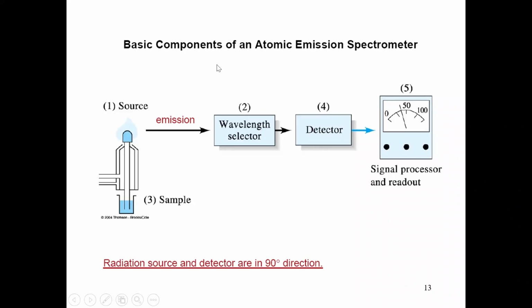So is the detector the photodiode? It can be a photodiode. The detector can be a mass spec. A mass spec is the detector. Or, remember the detector in UV, what was the detector? It can be a PMT, all right? For a mass spec, you are going for the charged ion.